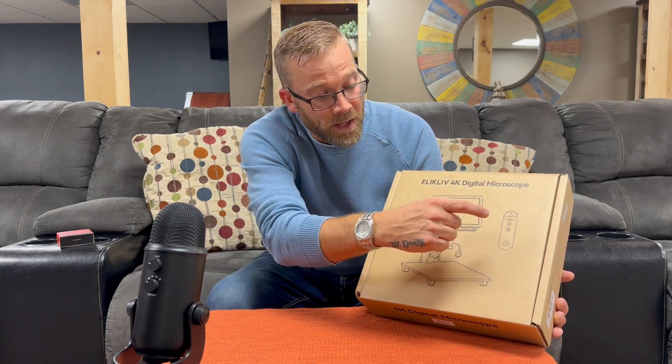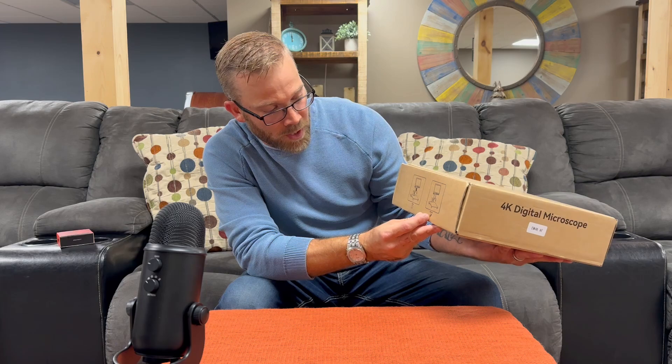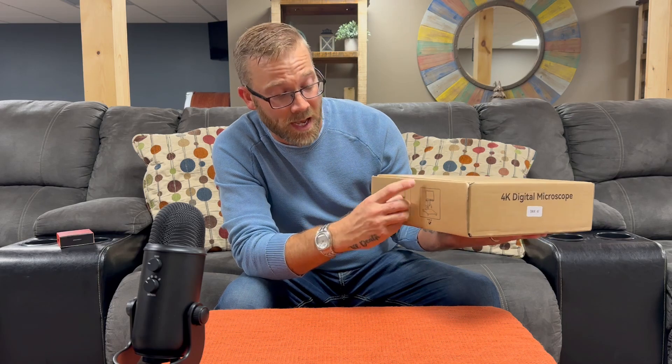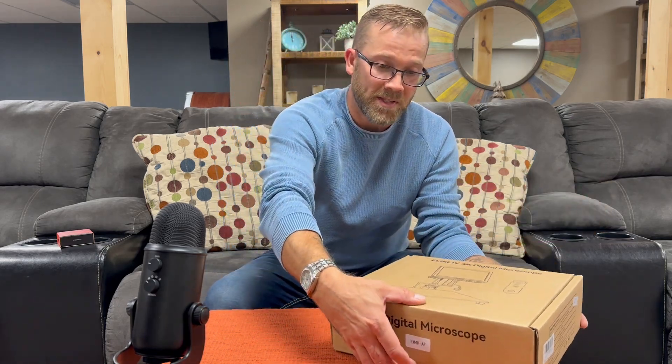The Alkaliv 4K digital microscope — this is what it's gonna look like when it's set up. It comes with a remote control and there are two versions. This one has a check mark — it's the EM 4K AF, for autofocus. They also have one that does not have autofocus.